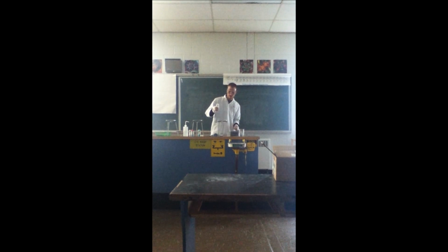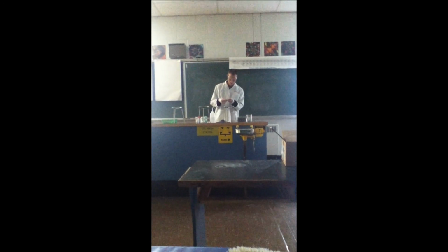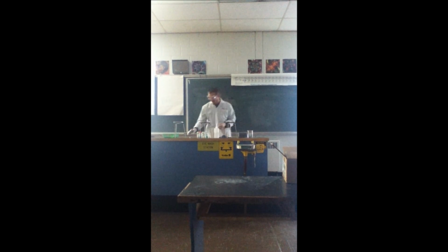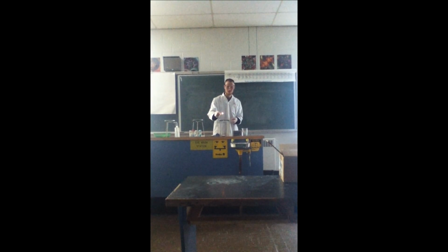Hopefully, you guys can see still from there. I may have to add a little bit more fuel. Can you see that? Can you see the red there? Yes. Okay, it's red. What I'll do is I'm going to add a little bit more ethanol, and I'll try it again because that burned up quite quickly. All right. Okay, a little more. All right. 3, 2, 1.